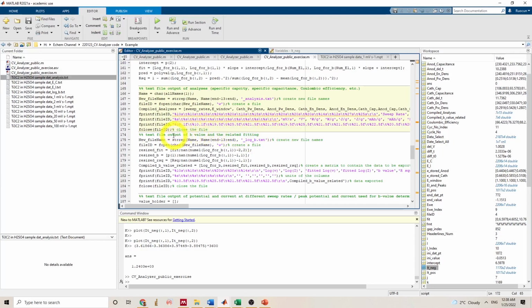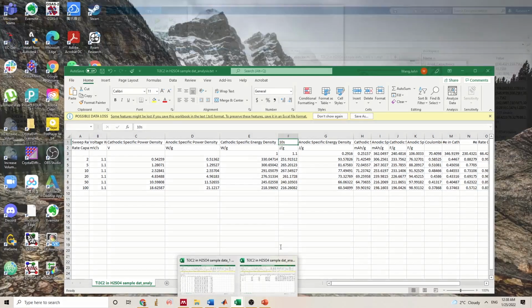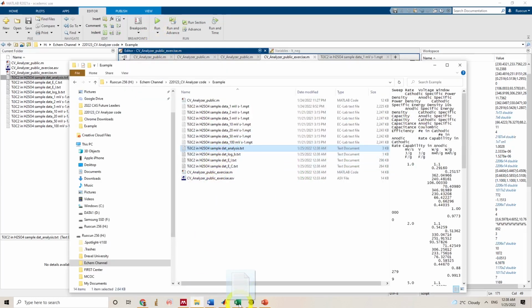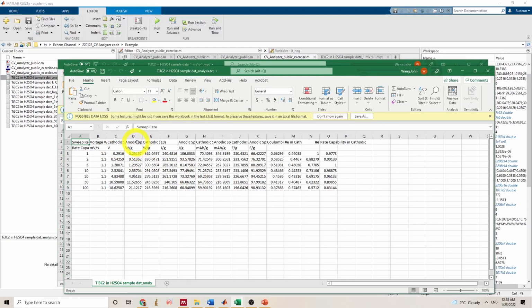I probably didn't do some of the copy pasting properly. Oh, I see, because of the unit I forgot to copy paste 4 copies. Do it again. Oh, and because I opened the file, don't save, run it again. Boom. Drag it into Excel. Okay, now this data looks more proper, at least the values.